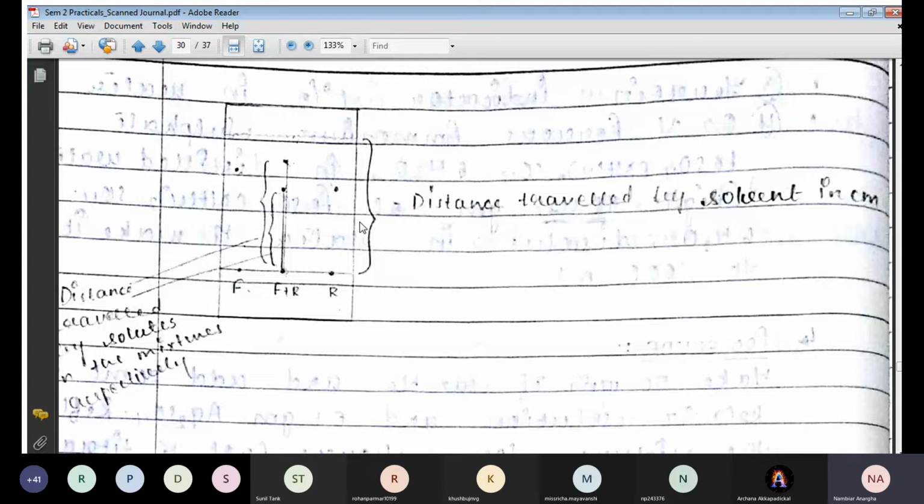So see, we have a line drawn in the upper side of our TLC plate. To that distance, we allow our solvent system to run. That is, the mobile system is allowed to go till there. Once it reaches there, you have to make sure that we are continuously monitoring our TLC run. We allow our mobile phase to run till that distance, and then we take out our TLC plate and allow it to air dry.